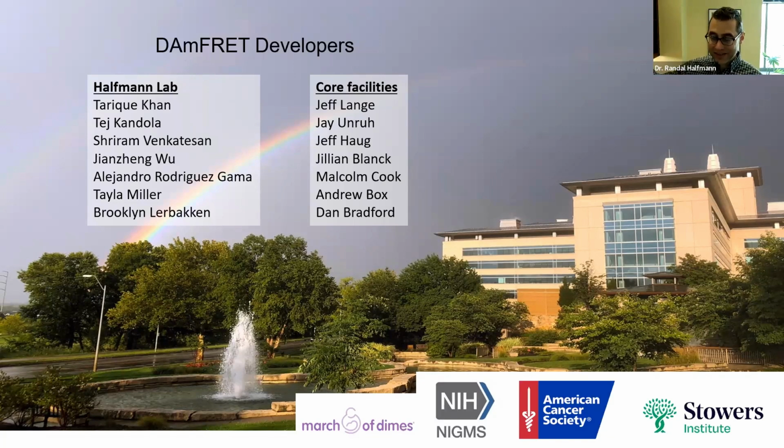And with that sorted list of sequences, if it's deep enough, you will be able to extract statistical couplings between positions that give you structural constraints on what the actual structure is.